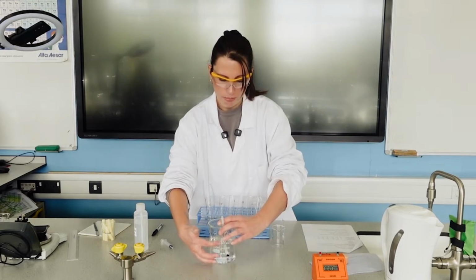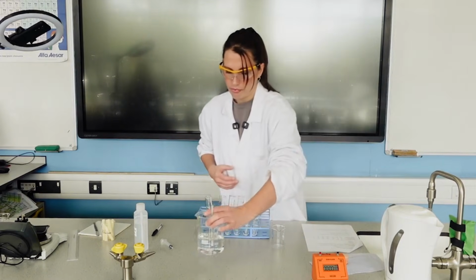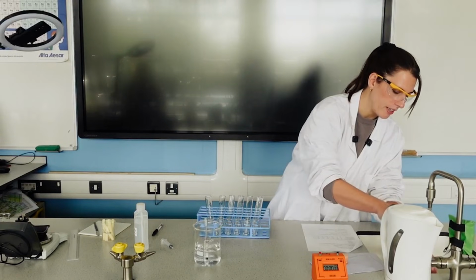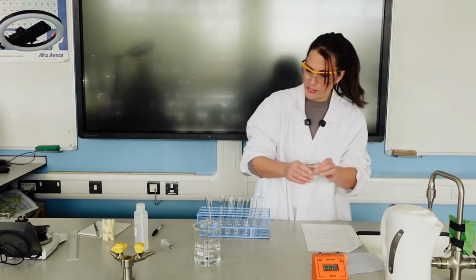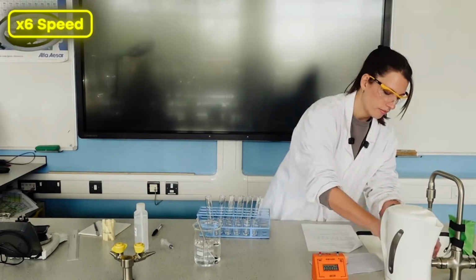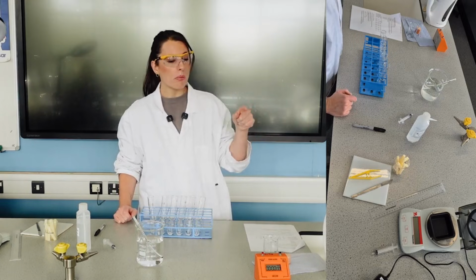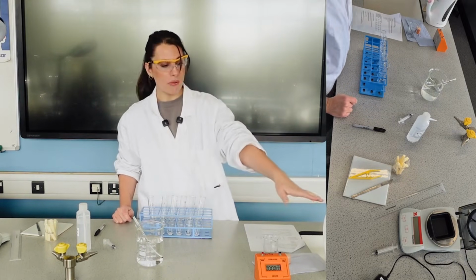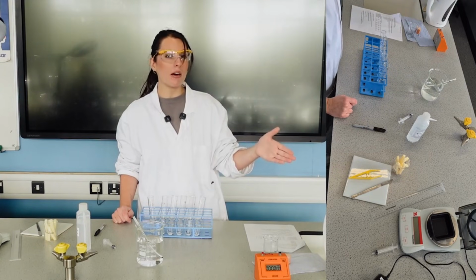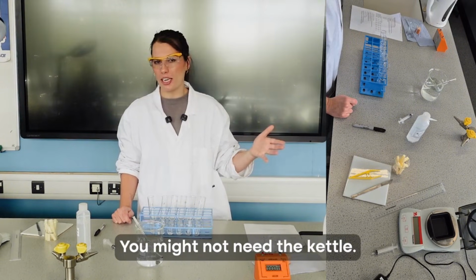Now at this stage, mine's getting a bit too full, so I'm going to pour some out. One beaker seems to drop it by about 10 degrees, and I'm still at 50. Now, depending on what temperature the hot water comes out of your taps, you probably wouldn't actually need a kettle for this because that was obviously a lot hotter than 30 degrees C. The water coming out of the taps may well be about 40 to 45 degrees C, so you might not need the kettle. So that's something that you could test in advance.